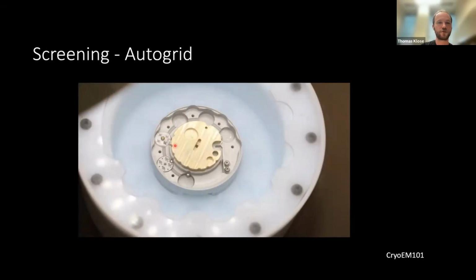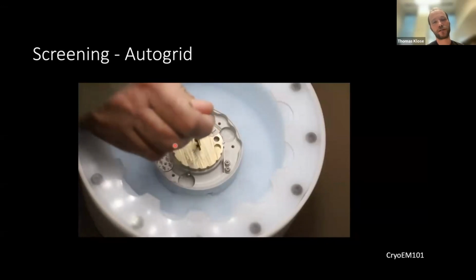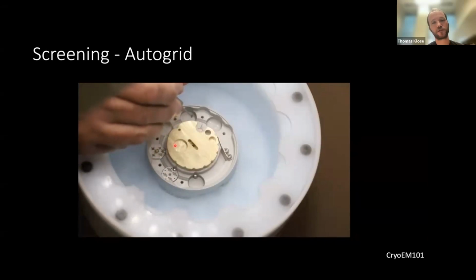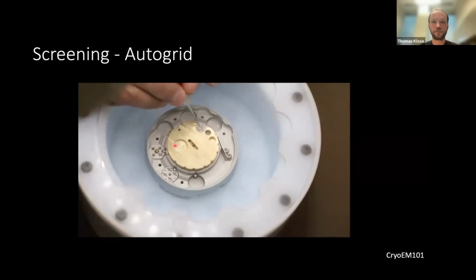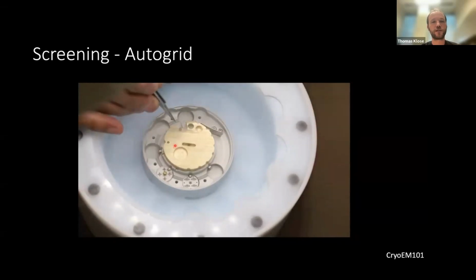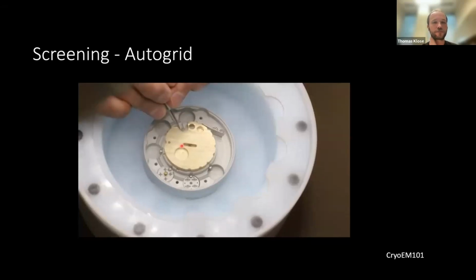Pick whichever grid you want. I guess they're going to go for this one. And then the grid gets transferred into the bottom part of the auto grid. Like this. So again, one has to be very gentle to not damage these grids, and the challenge is here that you're dealing with liquid nitrogen, which is minus 200 degrees centigrade. So you can't really get too close to it, otherwise it gets really cold and unpleasant. So you carefully position the grid in there.